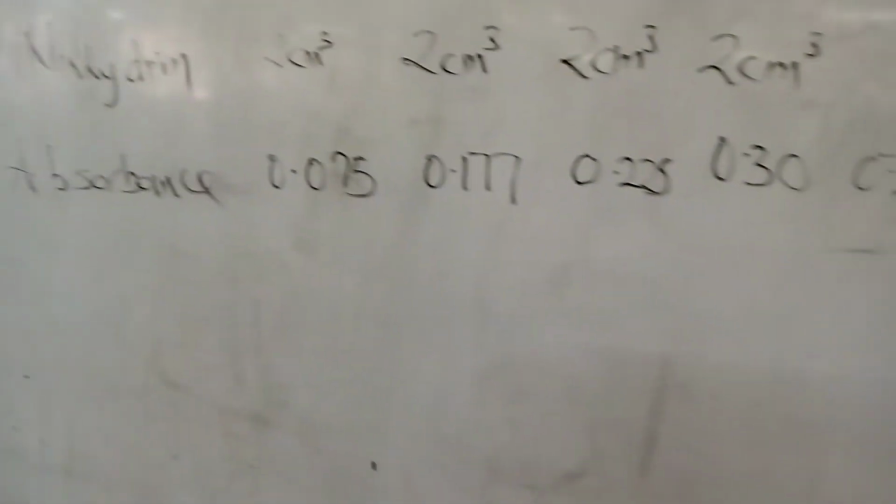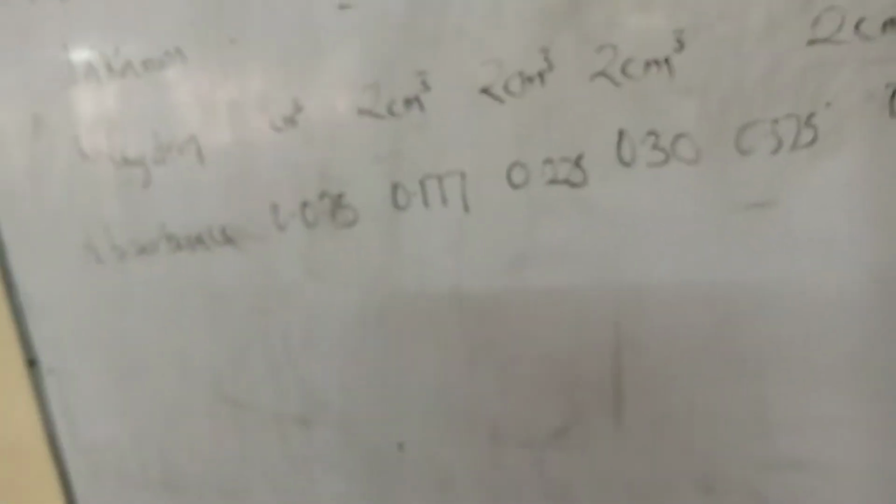So making use of these values, we can easily plot a graph.